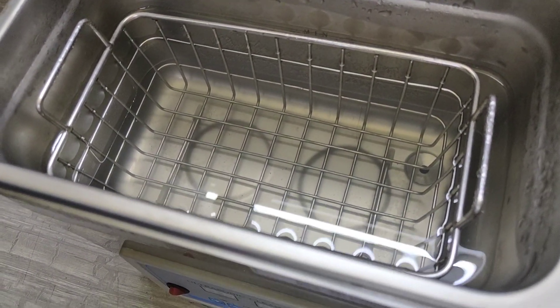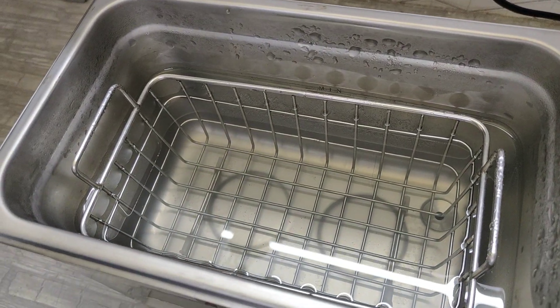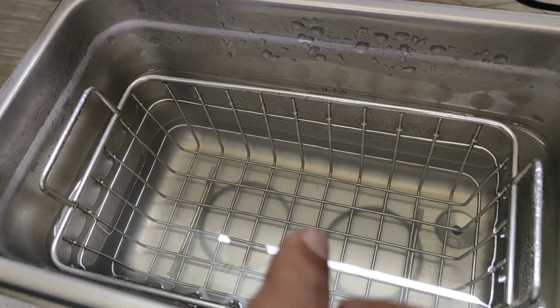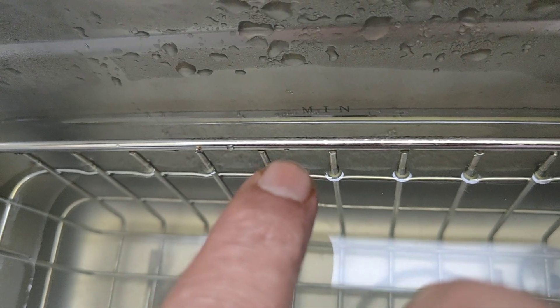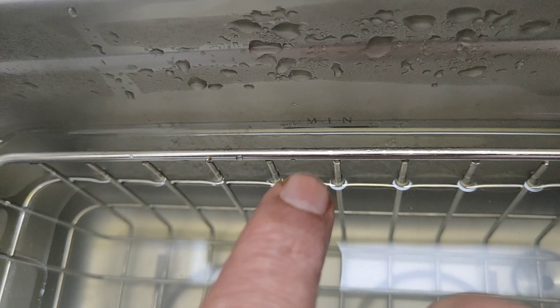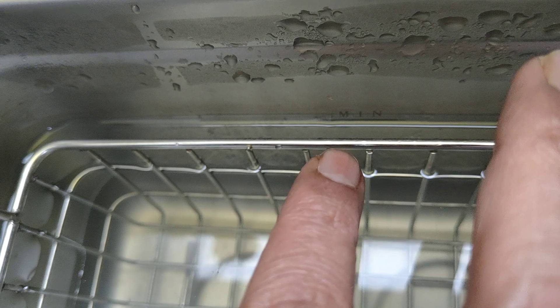An important point is that in this tank, we should fill minimum one third of the volume and maximum two thirds of the volume. If you look carefully, there is a mark labeled 'MIN' which indicates the minimum volume — the liquid level should always be above this mark.